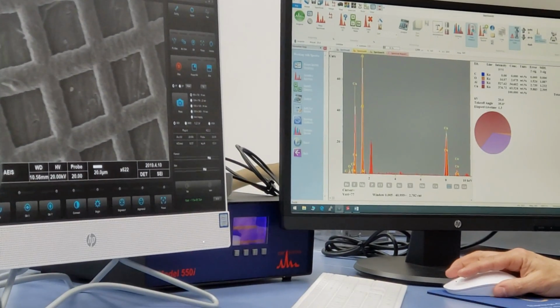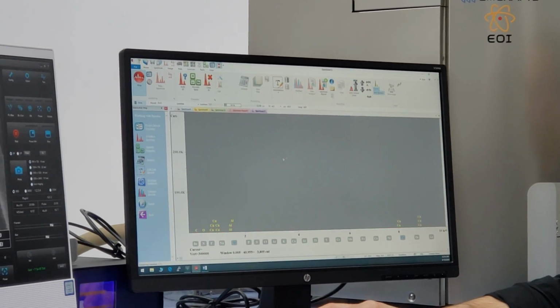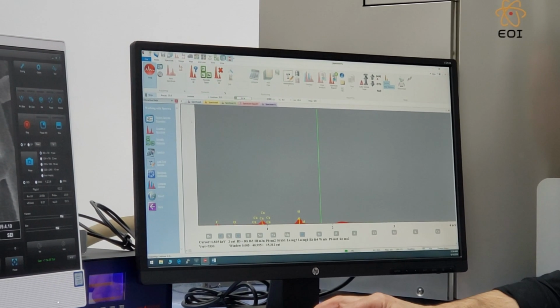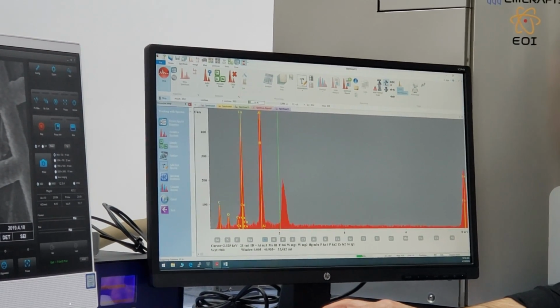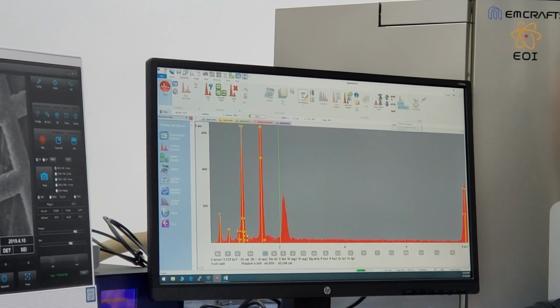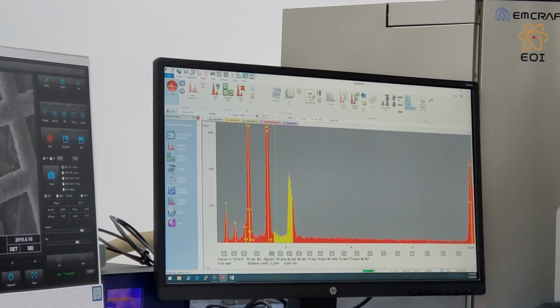But that was copy paste, and then auto vertical scale scales to the highest peak. So if we just open up the spectra window, without that selected, peaks are very low. You have to manipulate them using your mouse, or you can just very easily auto vertical scale that, and then up, down, shrink, separate, so on. Cursor: this gets rid of your cursor, so now you have no more cursor control. That puts the cursor back up again, so you want that to be valid.